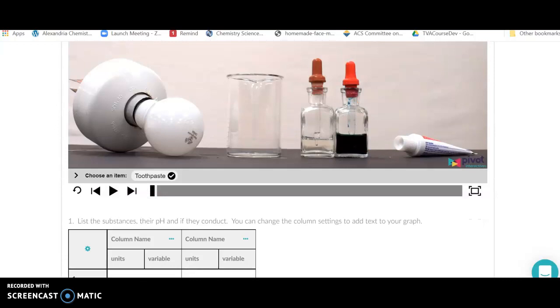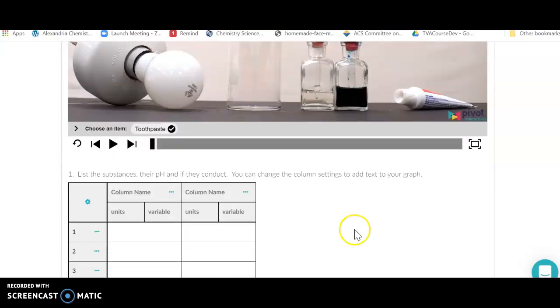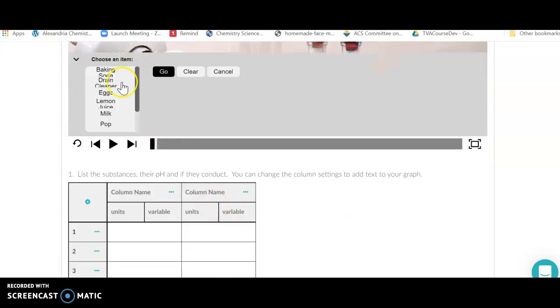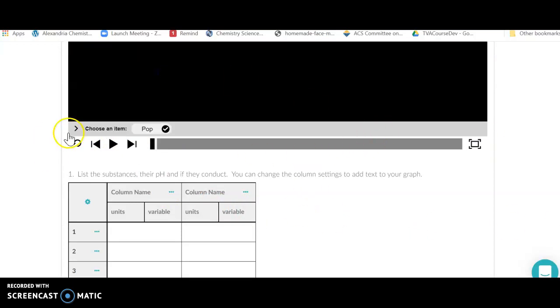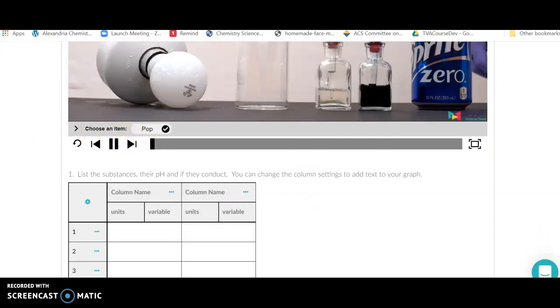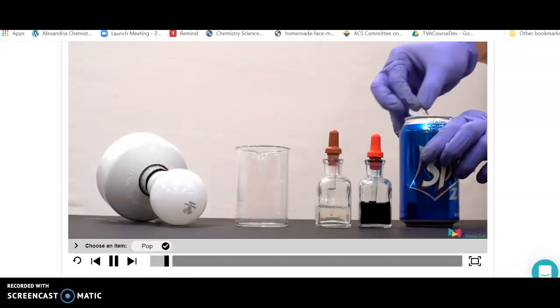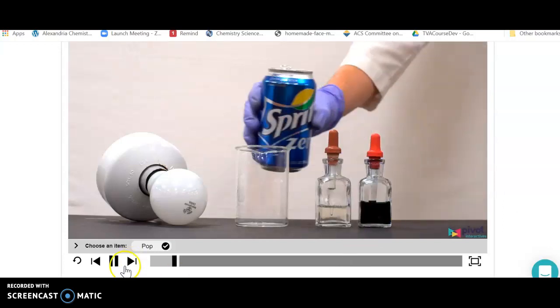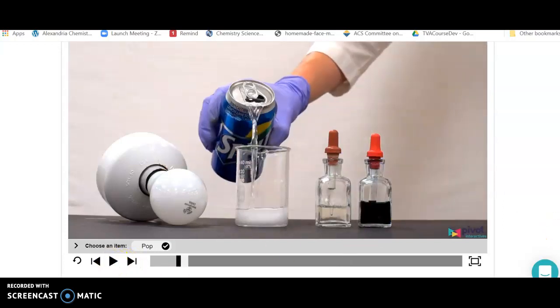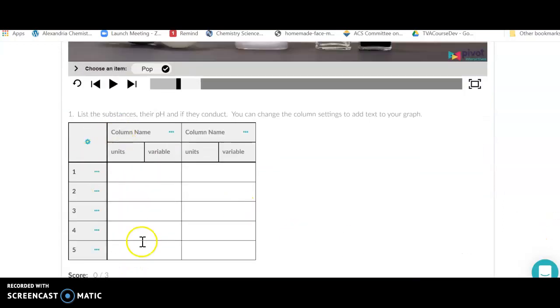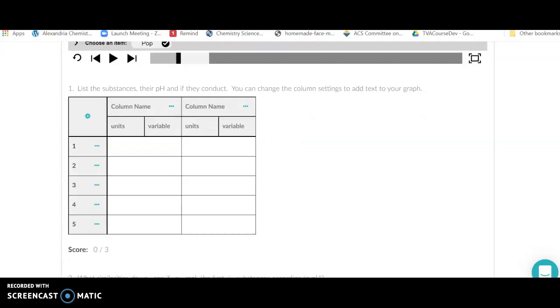The next one is we're going to look at some other substances, and we're going to use our indicators and test different substances. Now there's a whole bunch here. For example, you can do soda or pop, whatever you call it from the part of the world where you come from. So here we've got some sprite and they're going to pour it in and test its properties. Your job here is to go down and create a table such that you list the substance, its pH, and whether or not the solutions conduct.